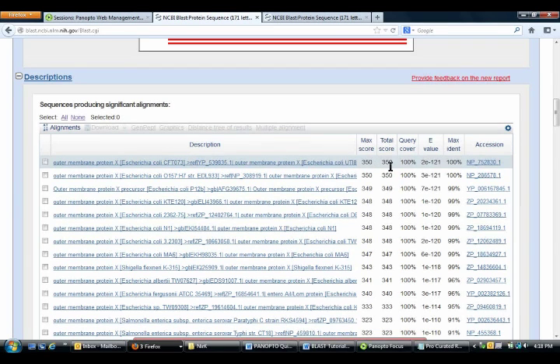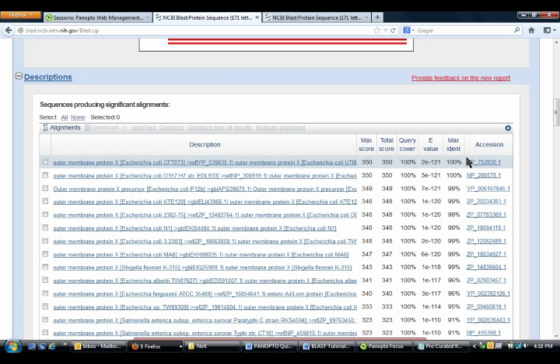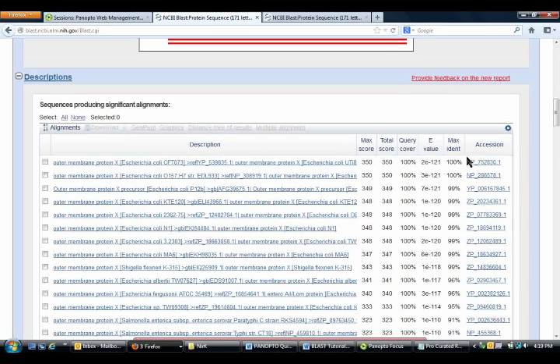Here we are given the max score, the total score, query cover, e-value, and max identity. Fill in the appropriate information on your small group sheet.